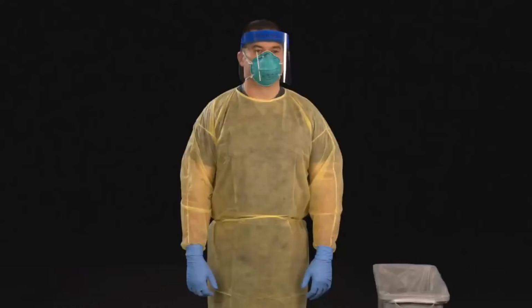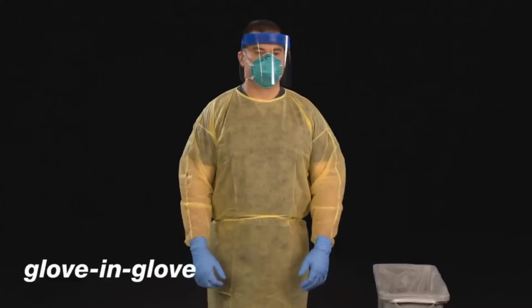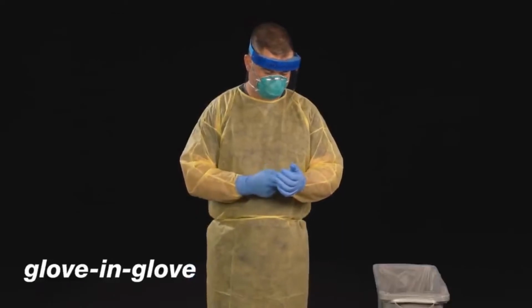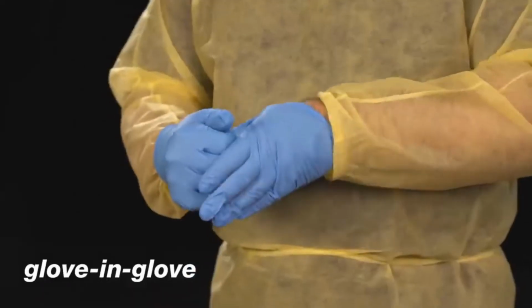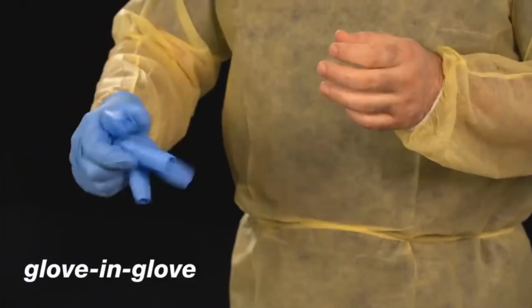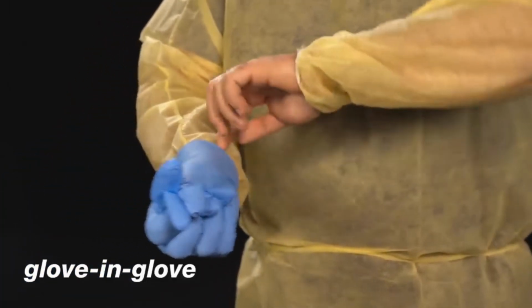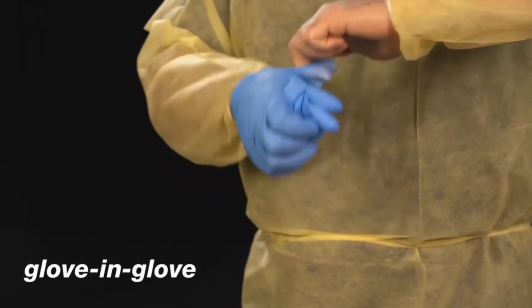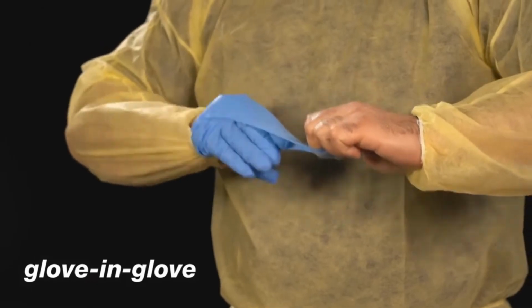Remove and discard your gloves. Gloves can be removed using more than one technique. For the glove in glove technique, pinch the outside of the glove near the wrist. Peel downwards, pulling the glove inside out. With your ungloved hand, slide your finger under the wrist of your remaining glove. Again, peel downwards, turning the glove inside out.